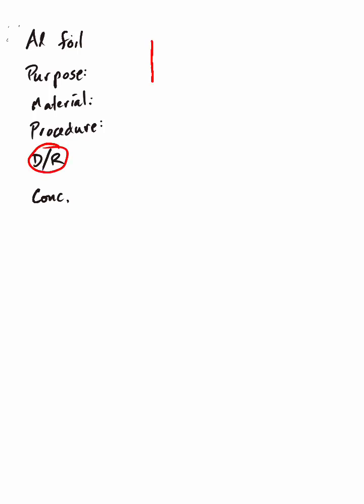Data and results. Really, we had two measurements. If you thought of our piece of foil, so here's the picture, if you thought of the foil as like a block, we were able to take and get a measurement with our ruler on these two edges, no problem.